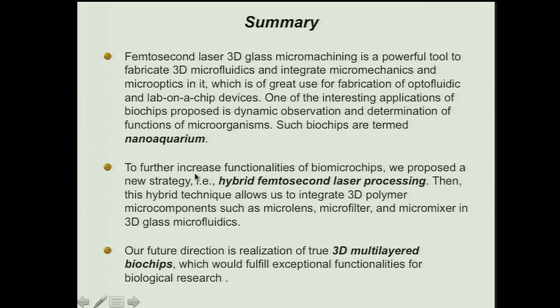Then, to further increase the functionalities of the biomicrochips, we propose a new strategy, which is hybrid femtosecond laser processing. This hybrid technique allows us to integrate three-dimensional polymer microcomponents, such as the microlens, microfilter, and micromixer, in the three-dimensional glass microfluidics. And our future direction of this project is the realization of true three-dimensional multi-layered biochips, which would fulfill exceptional functionalities for biological research.